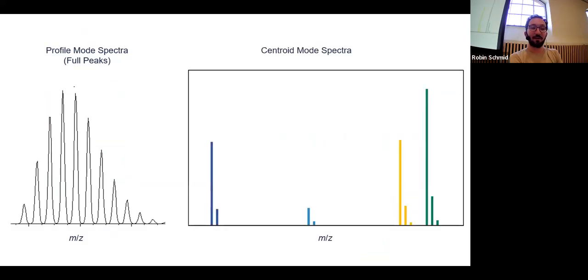And now, one very important thing that we always have to deal with is centroiding. So very often you might be acquiring the data in profile mode. There are some instruments that always acquire in centroid mode, because otherwise they can't handle the amount of data that they have to push. If you have really fast scanning TOF instruments, sometimes they always acquire in centroid. So internally, they already have to apply some peak picking. And peak picking, we know it from MZmine, there's always going to be something that goes wrong. So you always have to remind yourself that it's not necessarily perfect right now. There's always going to be improvement in the future.